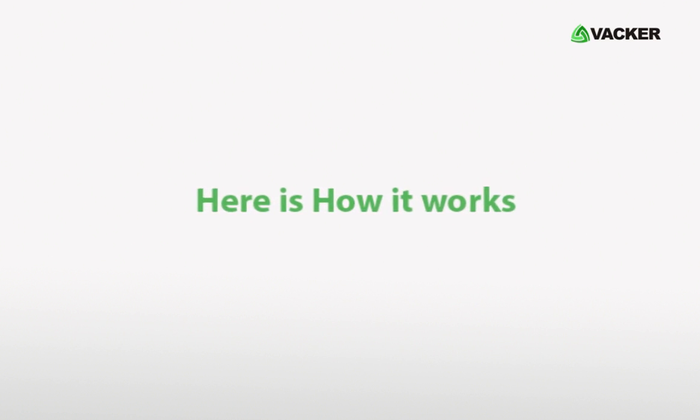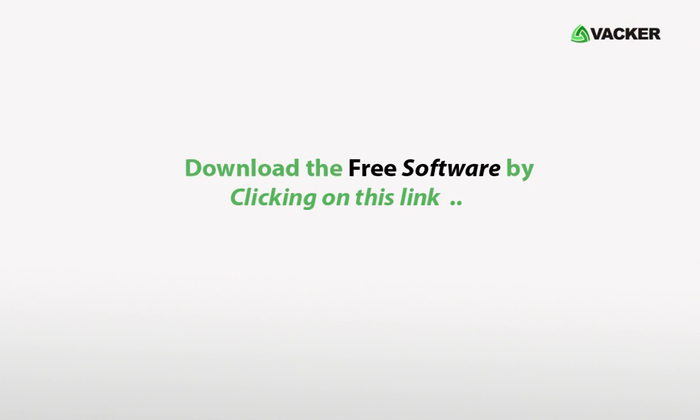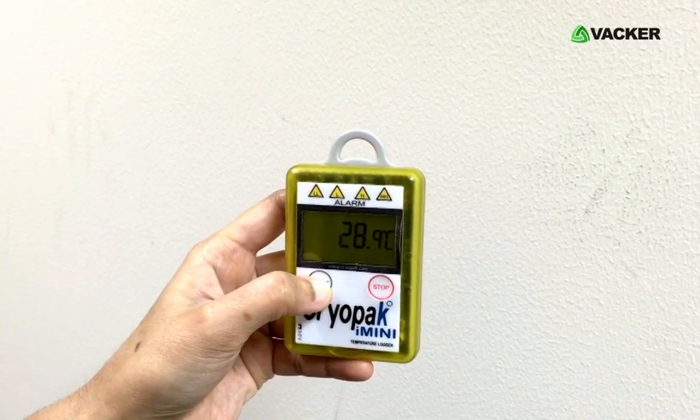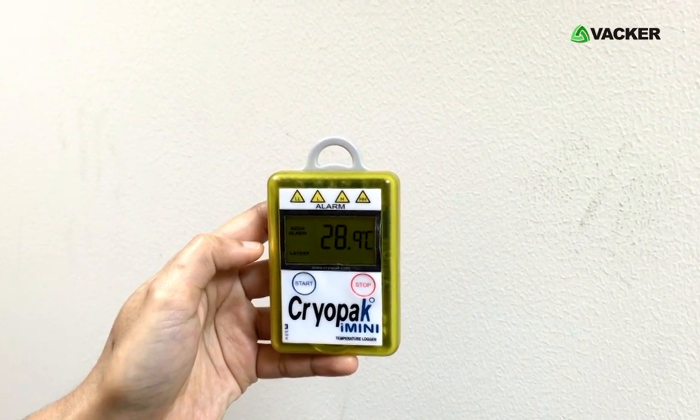Here is how it works. Firstly, program the device by using our free software — you can download it by clicking on this link. Then press the start button until you see the three small lines on the display, which indicates that the data logger has started. The device will show you the current temperature.